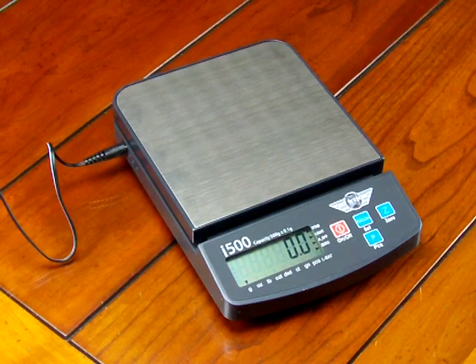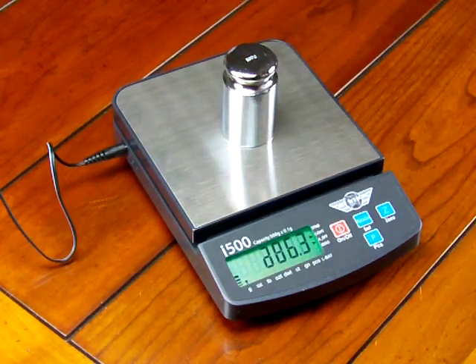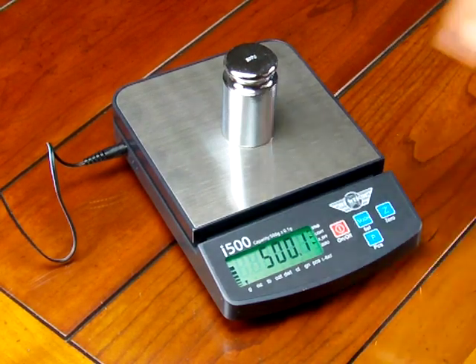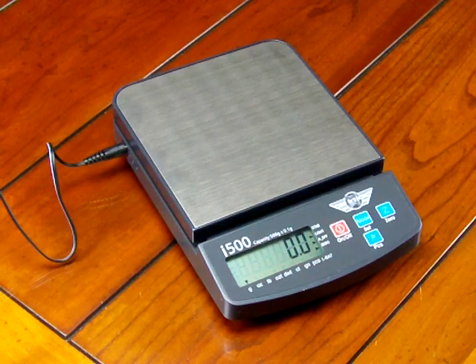This scale is 500 grams by a tenth of a gram. We'll put on a 500 gram mass and see what it reads. So it's already calibrated, but let's just go through the calibration to show you exactly how to calibrate the scale.